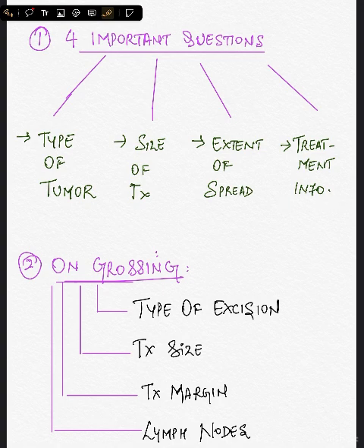Now, we must understand something. In any organ specimen, radiology findings are of utmost importance because the pathologist can correlate and confirm if the findings are appropriate, and if there are any additional findings, only if they have radiology findings to substantiate it.